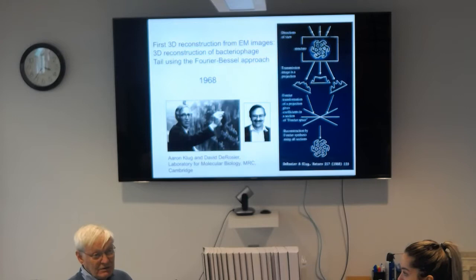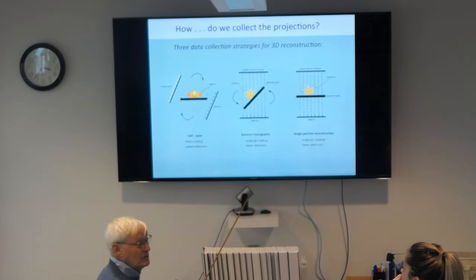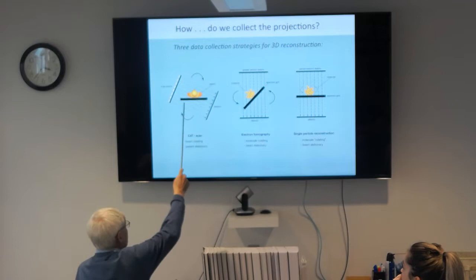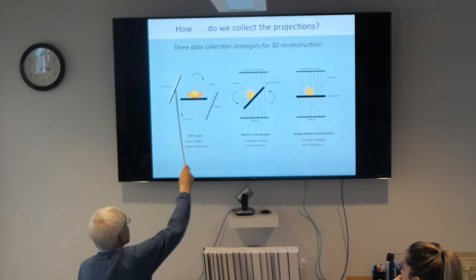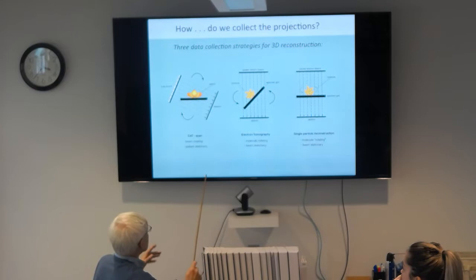Why can I not get a structure just from single molecules? Just a broad overview, which you probably immediately recognize because of the introduction: you get a CAT scan, a patient is stationary, the X-ray source detector arrangement is going around in steps, but the important thing is that it is just one patient and not many patients that we average in some way.